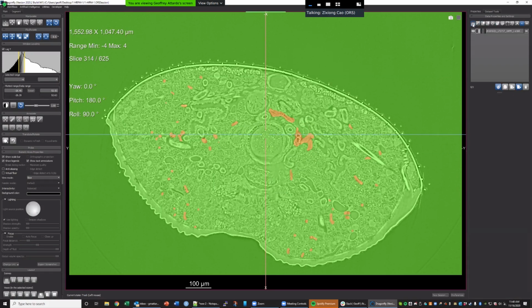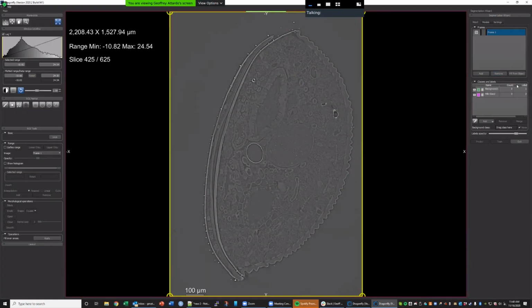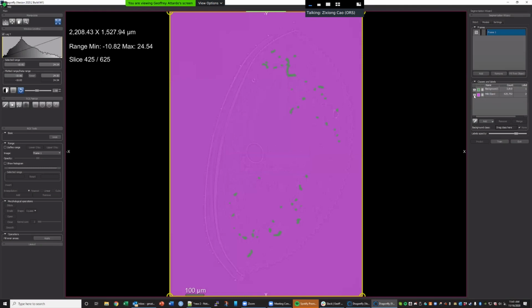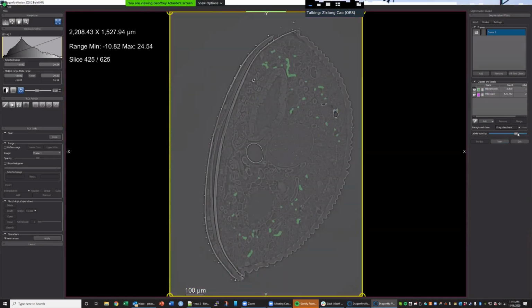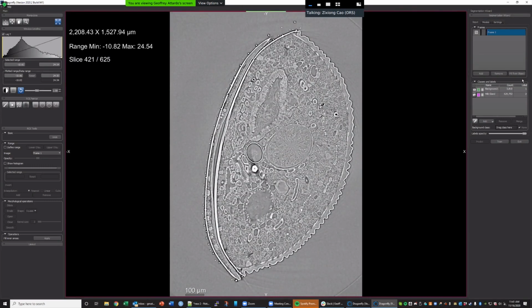So now we go back to the frame. Where's the frame? Segmentation Wizard. We go back to Segmentation Wizard, and now we do fill from object. You see the option here. This is the multi-ROI we just created. Now it filled, this is the background and this is the milk gland, but I filled it in wrong. That's okay, you just change the name. For you it's very easy because you can create many frames and fill the frames with the object. Then you are ready to train.